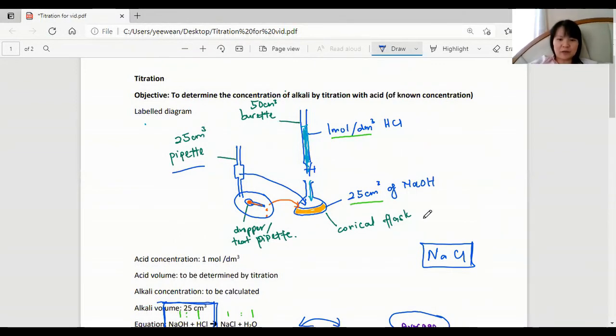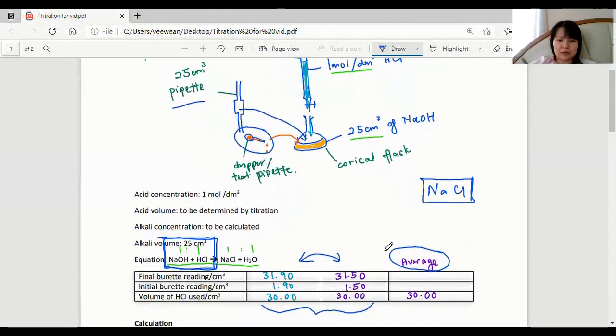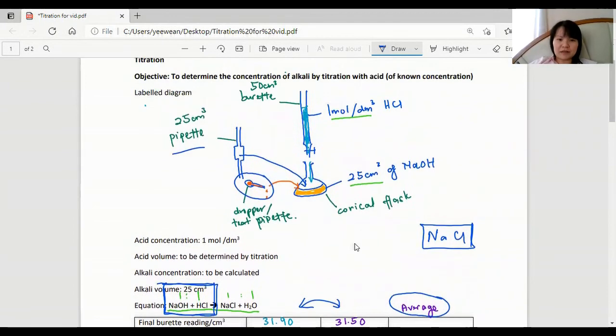So we'll have to repeat this experiment using the average value here, which is 30 centimeter cubes. And we'll repeat that without an indicator, just 30 centimeter cubes directly from the burette.